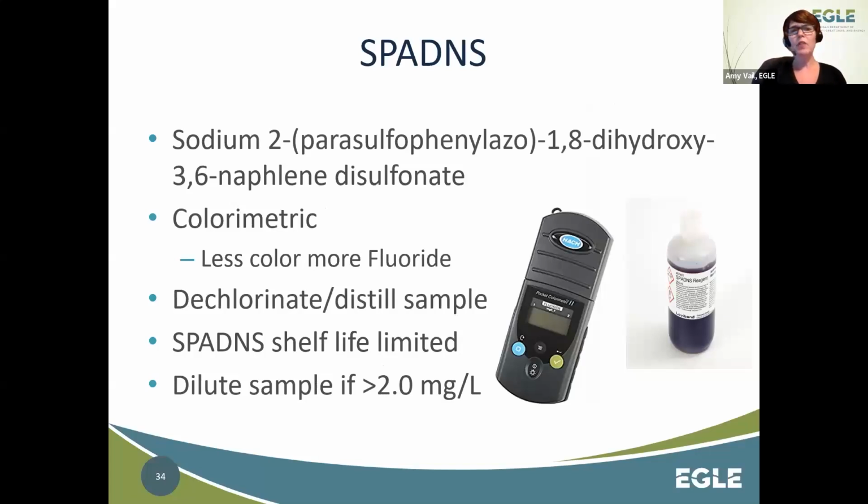The SPADNS method. SPADNS stands for sodium 2-parasulfophenylazo 1,8-dihydroxy 3,6 naphthalene disulfonate. Again, another one where we don't want to do a tongue twister. This is just a colorimetric method. So just like Hach's colorimetric method, the DPD for chlorine, this is very similar.